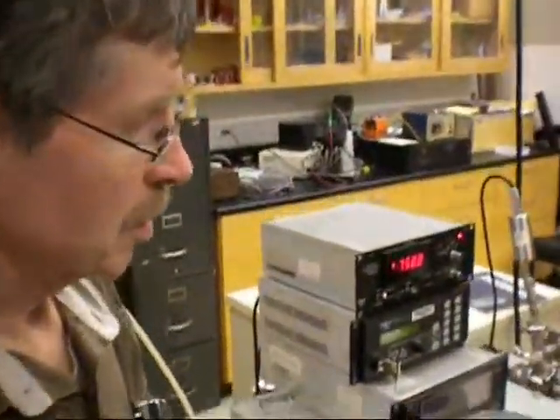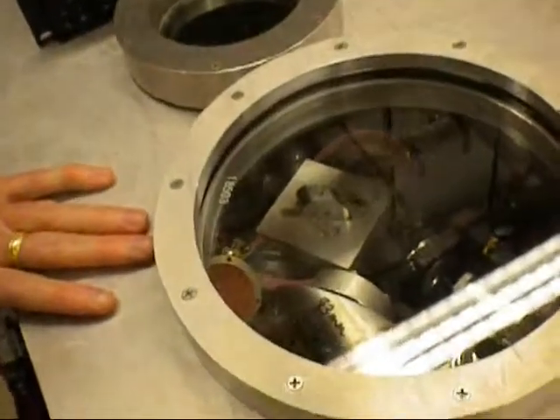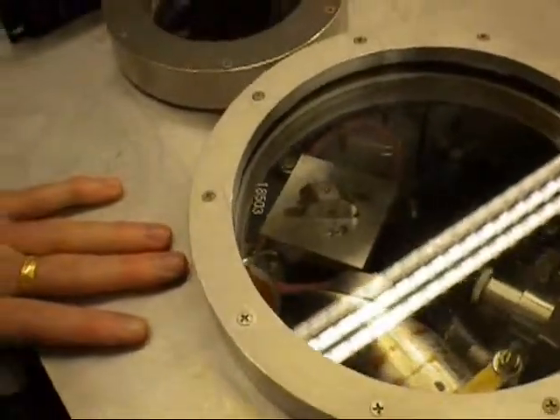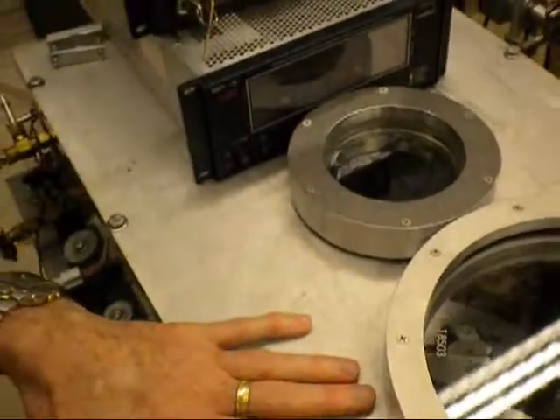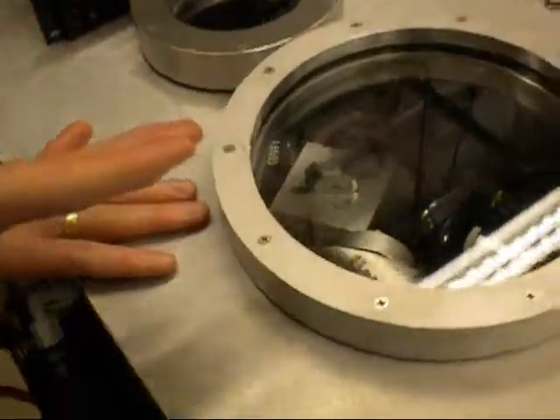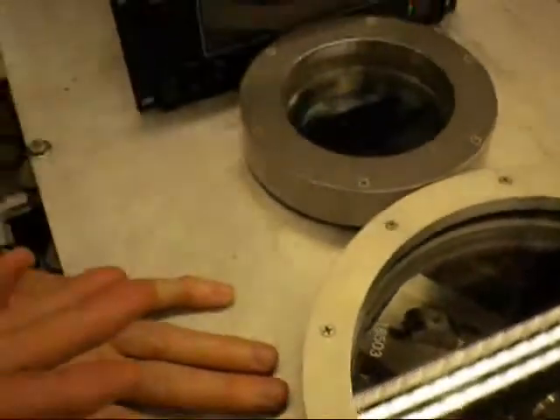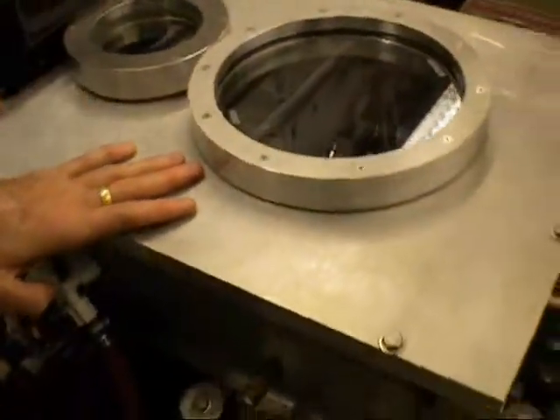But the funny thing was, the original optics came from a Russian source. In fact, we built this before commercially available titanium sapphire lasers were generally available within the US. And so some of the optics now have become coherent optics, but some of the optics are still Russian ones in the sense of the output couplers.